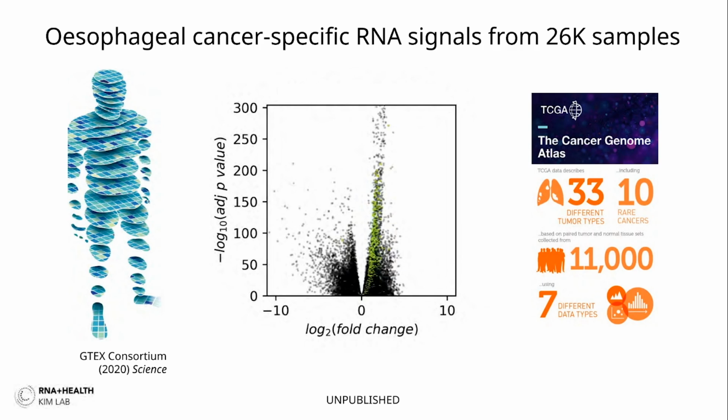And so if you were to do this sequencing-based approach, this liquid biopsy approach, for any individual, even if we didn't know what cancer they had, if we saw specific cell-free RNAs, we'd be able to say that this is most likely coming from this particular tissue. And so this would enable a follow-up through various imaging modalities to confirm whether there is a tumor, for example, in the esophagus or in the liver or the lung or other tissues.